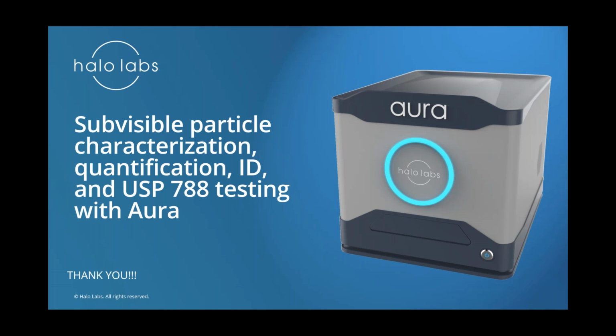Another question is, do we detect silicone oil? It's a good question, and the short answer is no. Silicone oil tends to flow through the membrane. It's been published in the paper I referenced from Coriolis, as well as in our own early insights.